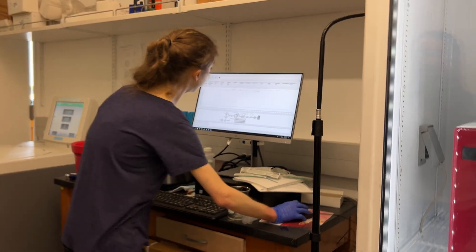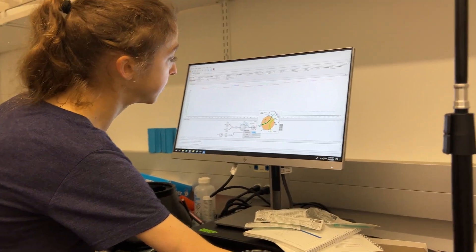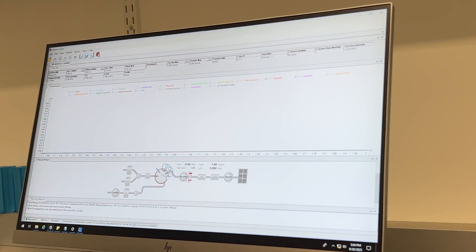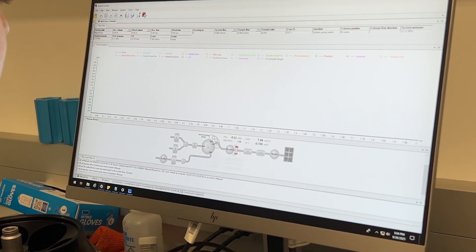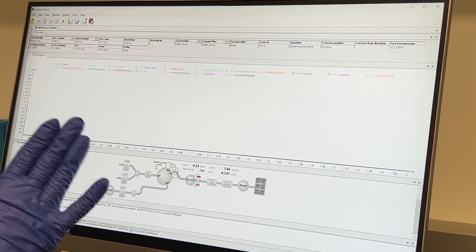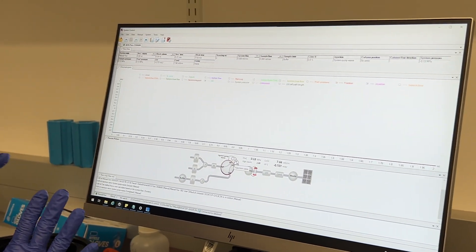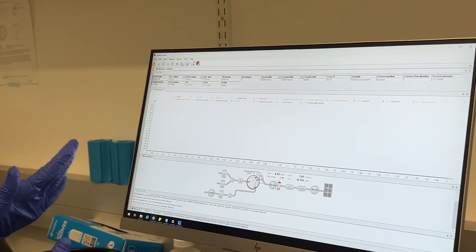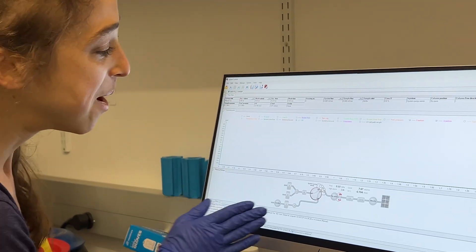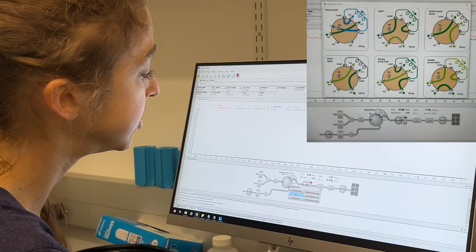What I'm going to do now is just change it to a different setting — system pump waste. That way it's just not doing anything with that sample loop. It's not technically necessary according to the Cytiva people, but I'm just a little paranoid about that. So let's just bypass that entirely until we go and tell the machine to actually inject it.